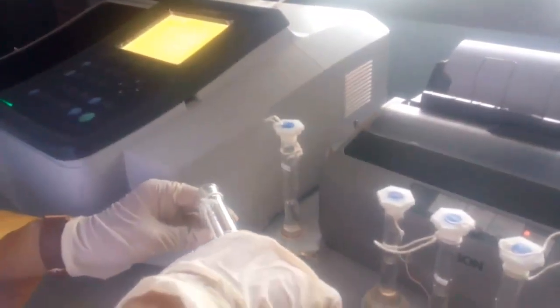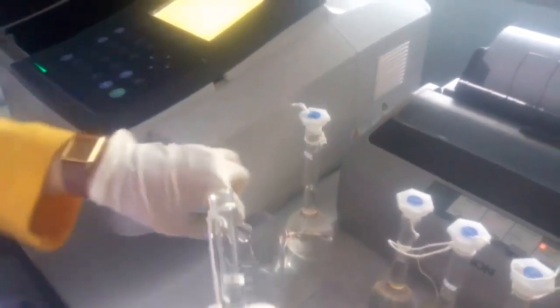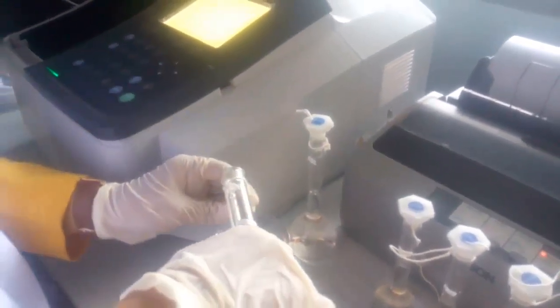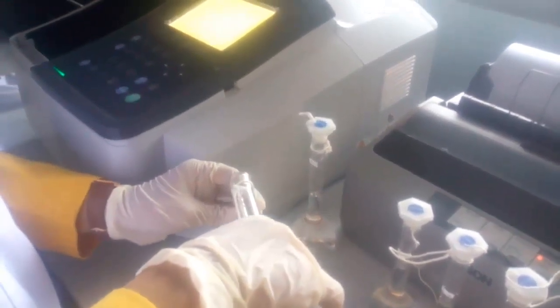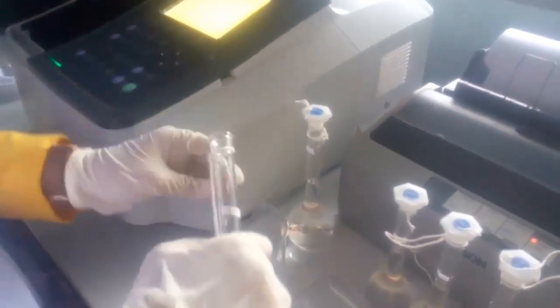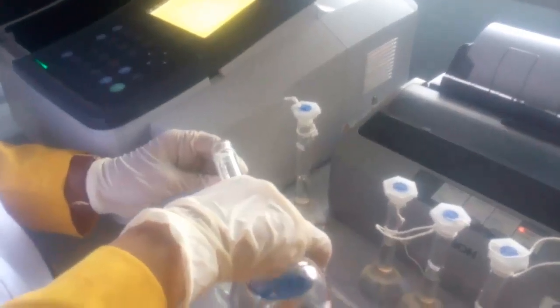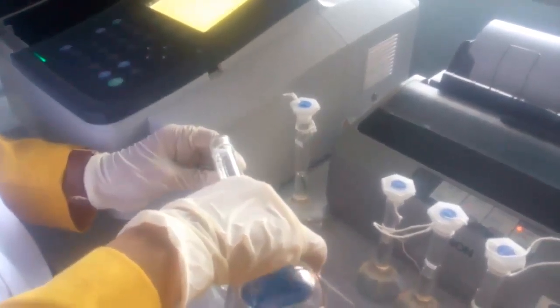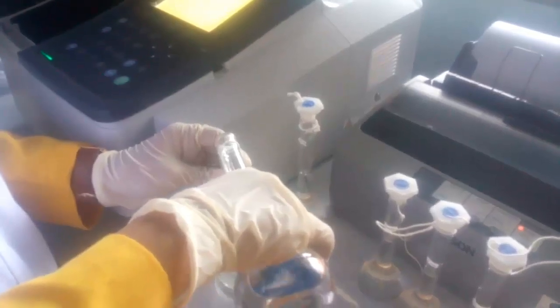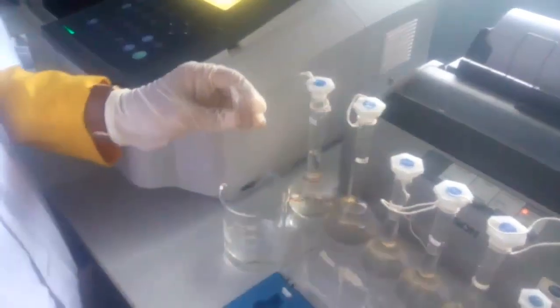Wash off the cuvette with 8 ppm standard of chloramphenicol. Fill up the cuvette with 8 ppm standard of chloramphenicol. Then wipe the cuvette with tissue.